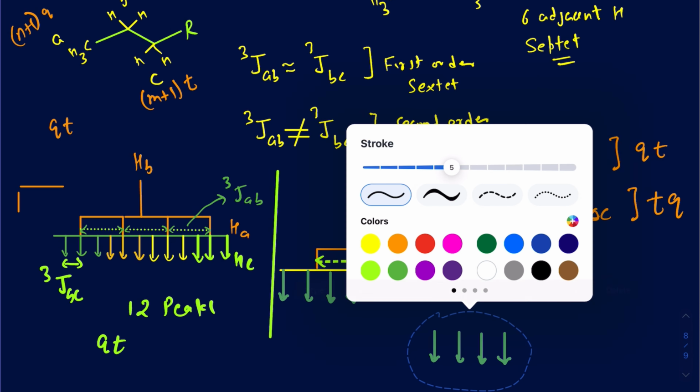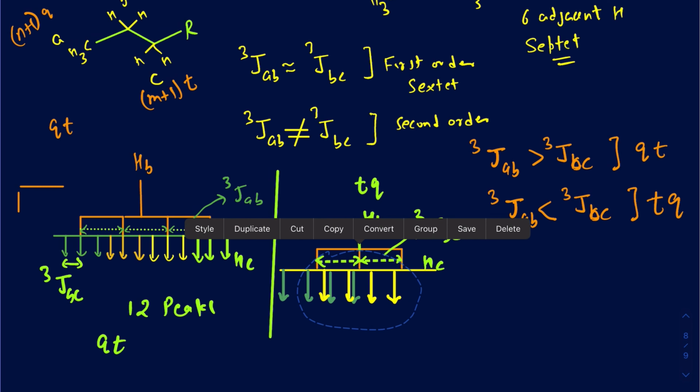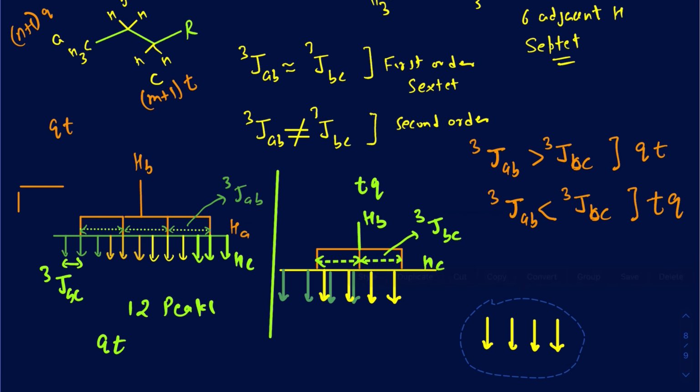and now because of this second proton, or the one in the middle, I'm going to be seeing the splitting again, and I can go and change the color on this, and that would be right here. Now you can start seeing how they're actually overlapping with one another, but then you would still see 4 signals there, or 4 peaks rather, not want to call signals. And then I would see another set here because of the third one. So I want to keep that in the middle right here.